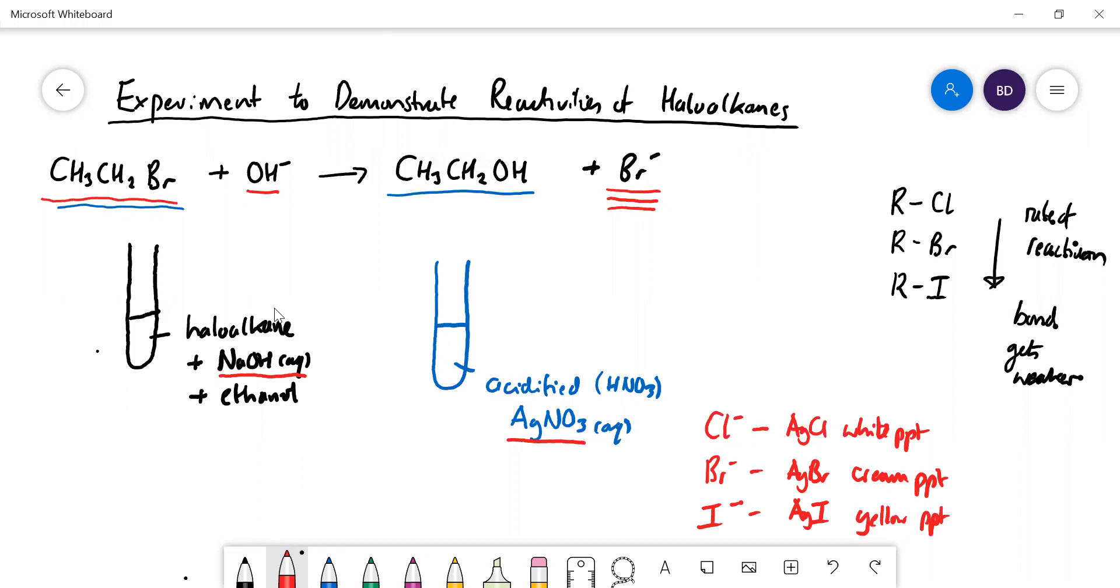So we're going to test for the formation of the halide ion essentially. That's how we're going to tell if the reactions occurred.